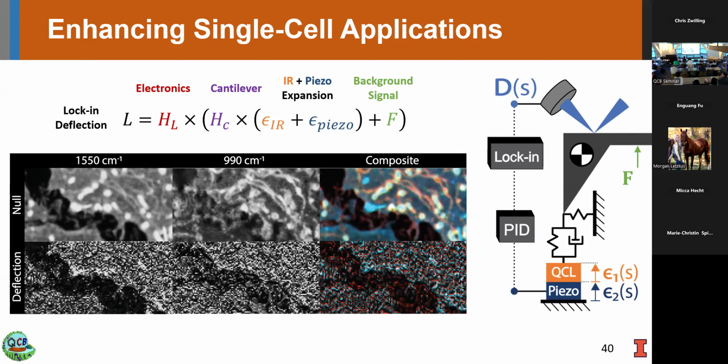Am I right that as a proxy for ground truth, if you just took a panel of standard fluorescence labels for membrane, cell wall, protein, sugar, stuff like that, they could serve together as a ground truth, right? Yeah. Yeah, we just haven't gotten to that stage yet.